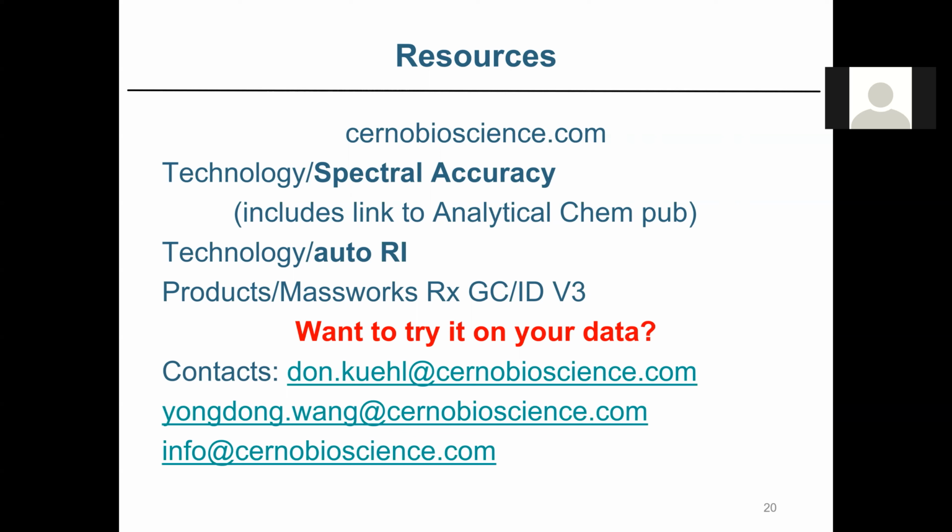I showed the alkane one. It's the most common one that people use. But for example, if you have a set of standards that you run as a validation set every day, as long as you have peaks that span the whole chromatogram, you have the option of going in and custom defining those compounds, and you just enter the retention index of them. So you don't need alkanes. You can use anything you want to calibrate, including the auto RI, which actually uses the data itself to calibrate.